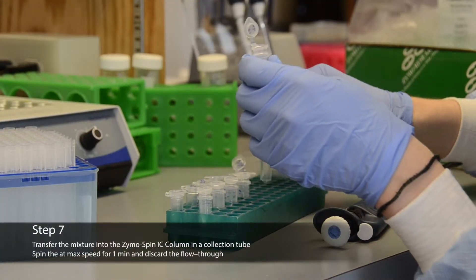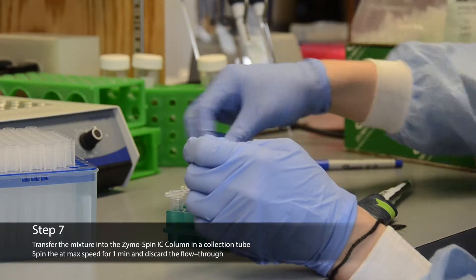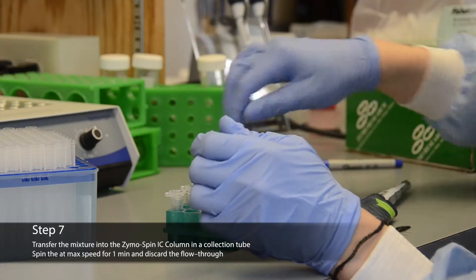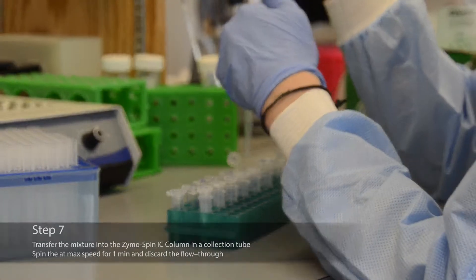Transfer the mixture to the Zymo Spin IC column in a collection tube and centrifuge at max speed for one minute. Discard any flow through.